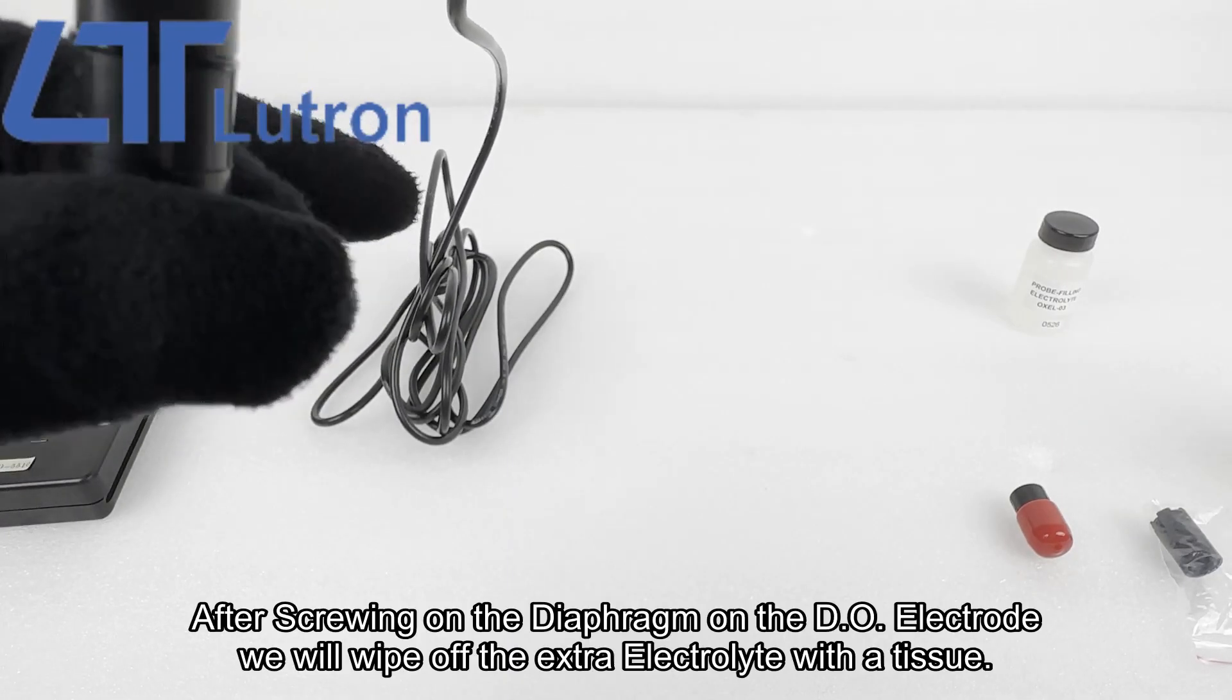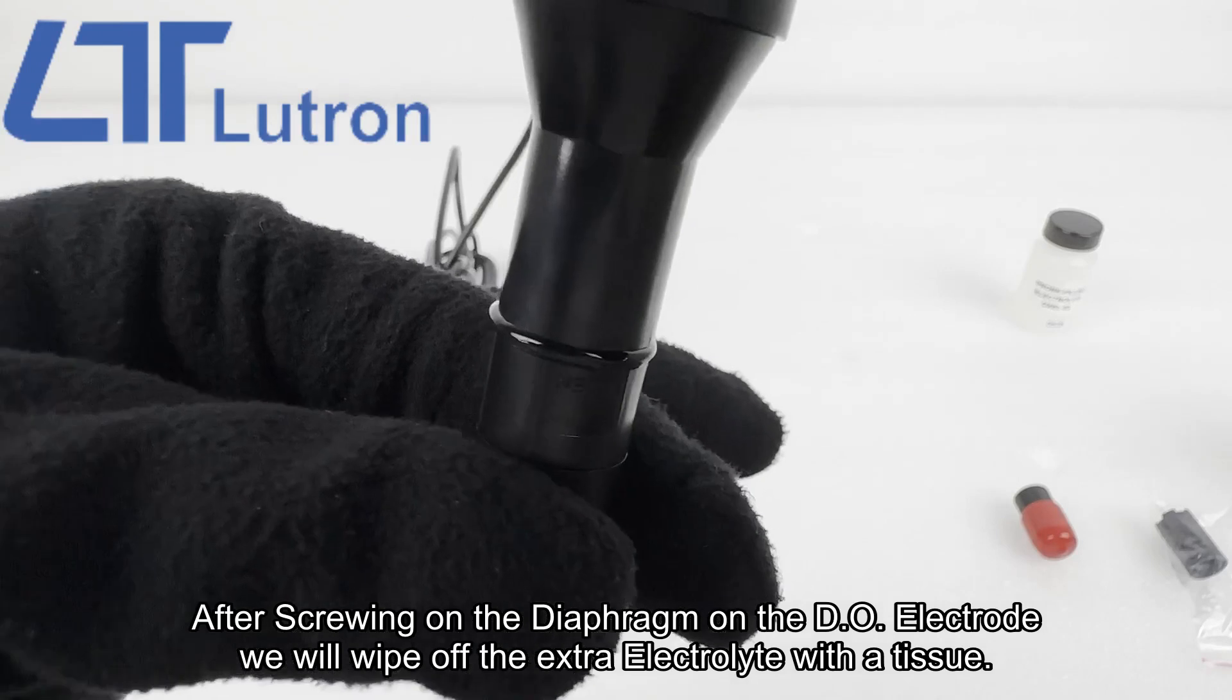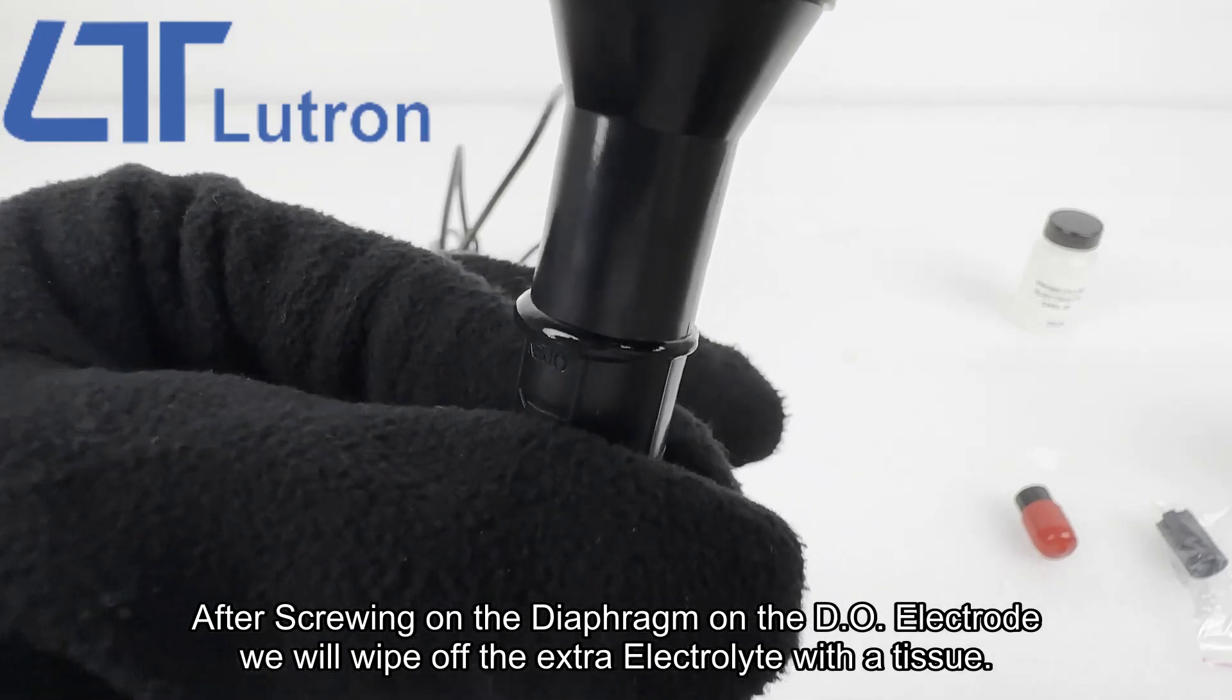After screwing on the diaphragm on the DO electrode, we will wipe off the extra electrolyte with the tissue.